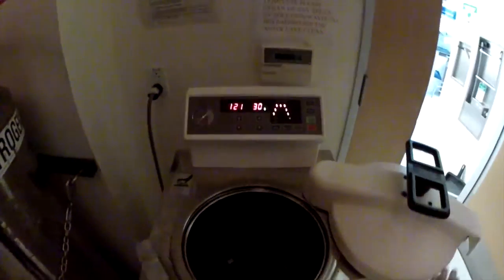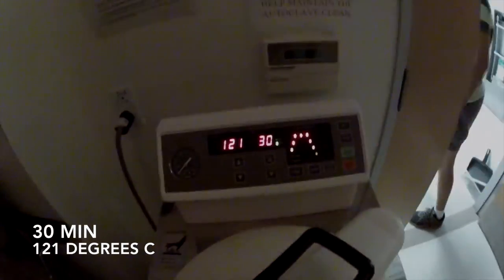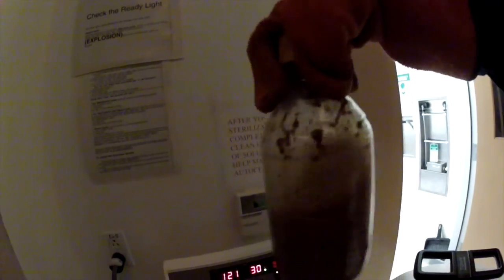Next, we autoclave our diet for 30 minutes at 121 degrees Celsius. When it comes out of the autoclave, be sure to shake it again before pouring tubes to make sure it's properly mixed.